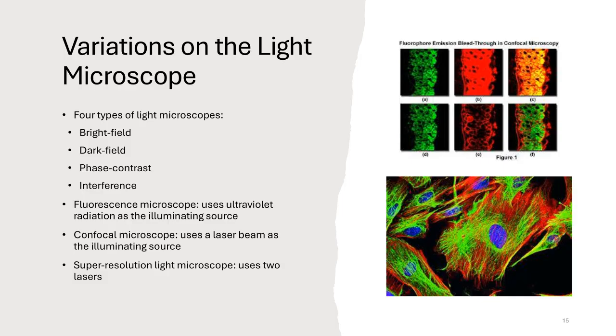Confocal microscopy can also give you that kind of fluorescence. We can use that with live samples and actually look at how those dyes, as they're attached to different tissues or different proteins, are moving around in a living system.